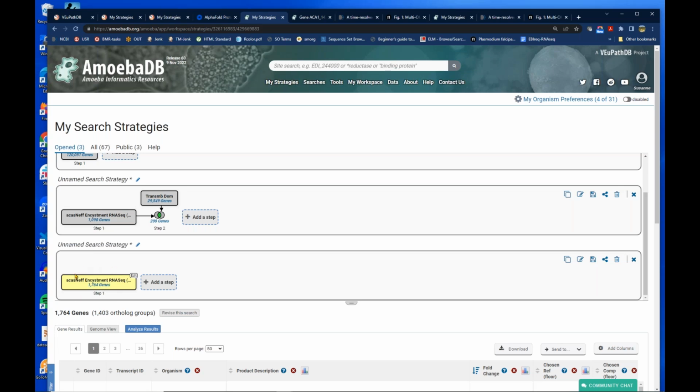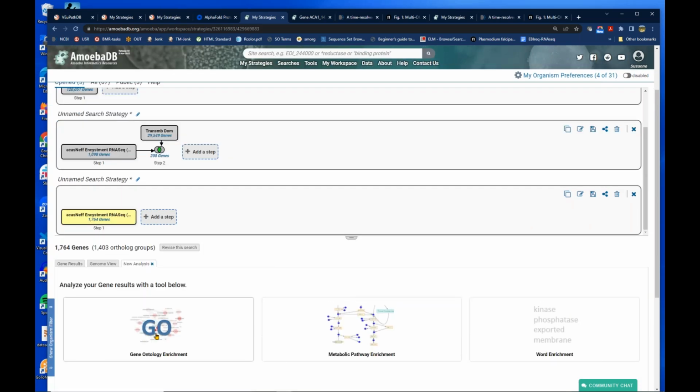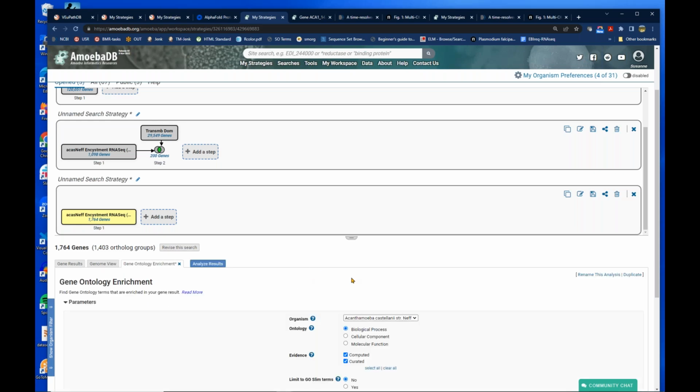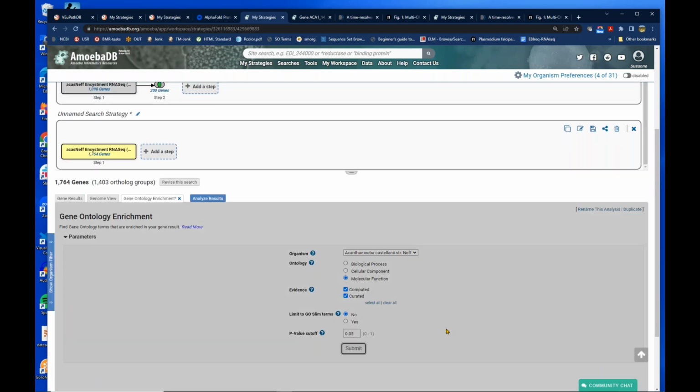So this is a fold change where you can explore different groups of data or samples, whereas this is a little bit more limited, but is backed up by statistical analysis. So then you also have the GO analysis available, GO enrichment. Go ahead and run that and see how that differs.